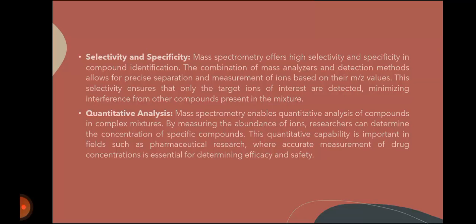The combination of mass analyzer and detection methods allows for precise separation and measurement of ions based on their mass over charge values. This selectivity ensures that only the target ions of interest are detected, minimizing interference from other compounds present in the mixture. Quantitative analysis.